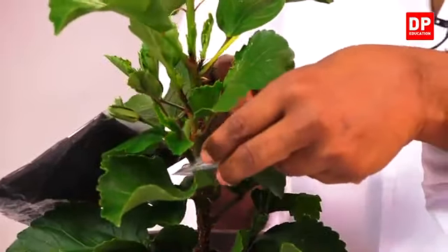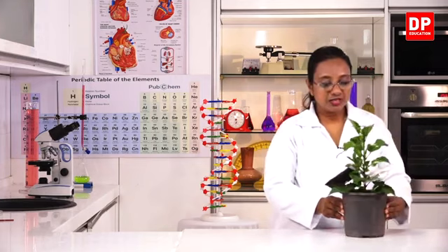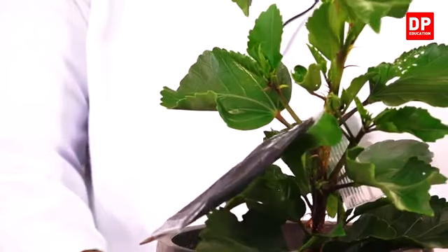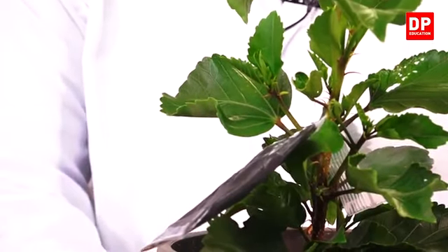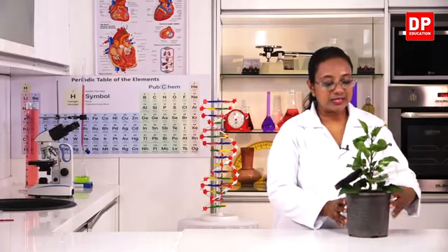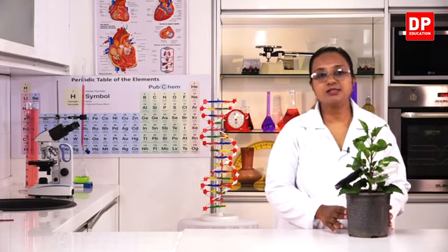So now students, you can see the two leaves covered, one with a transparent polythene bag and the other with a black color polythene bag. So, there is no sunlight for this leaf and there is sunlight falling on this leaf. Apart from that, all the factors are the same.